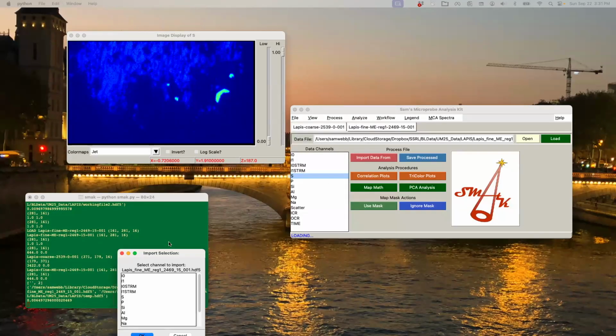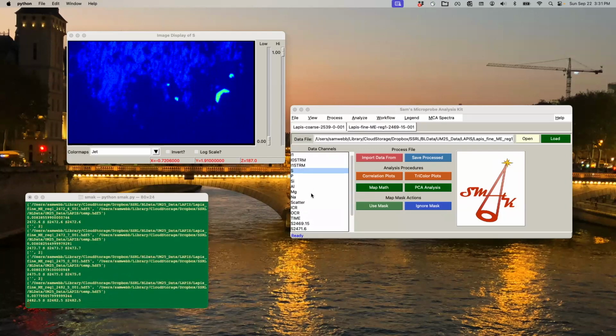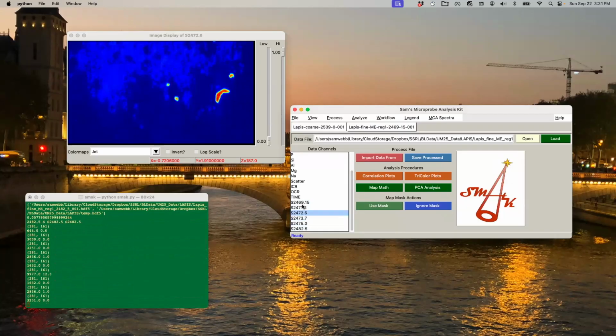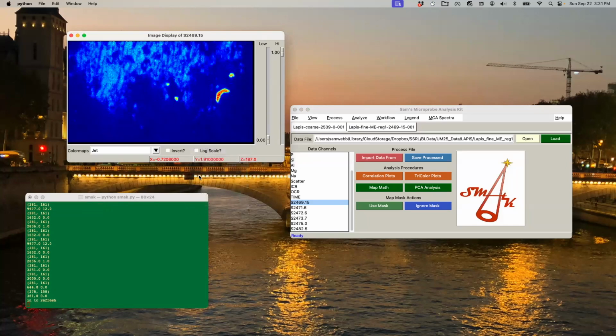The window comes down in the bottom corner here that says what channel. The sulfur is the one that's varying. So I click on sulfur, and it gives us sulfur. And we see, oh, look, things change. Woohoo. Awesome. Got one bad line there that I'll need to worry about, but we'll make it work. So what we're going to do is I'm going to edge remove here. There we go. Get rid of the one bad pixel.